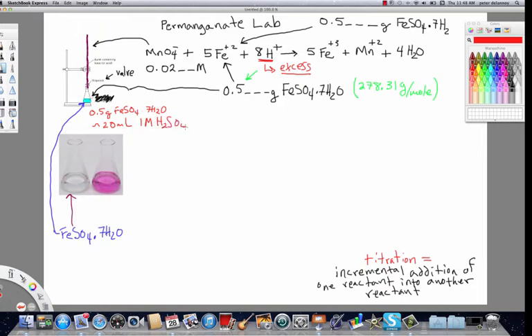Normally, if the student is careful about this and makes sure not to shortcut this step, then the sulfuric acid, which is providing the hydrogen ions, the H pluses, provides enough of that material so that the H plus is in excess.